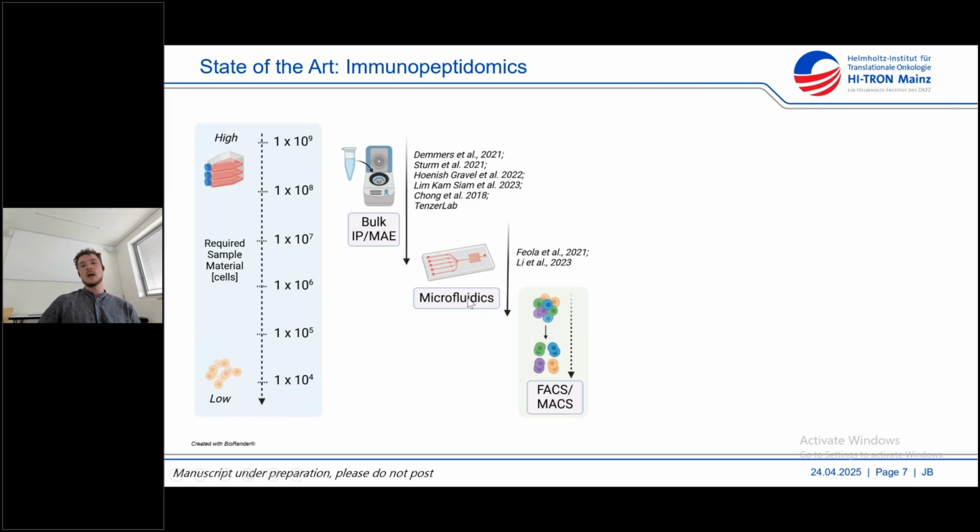Okay, what I'm going to present you today in this webinar is a method that we came up with. As I said, it is termed MAETi, mild acid elution in a tip.